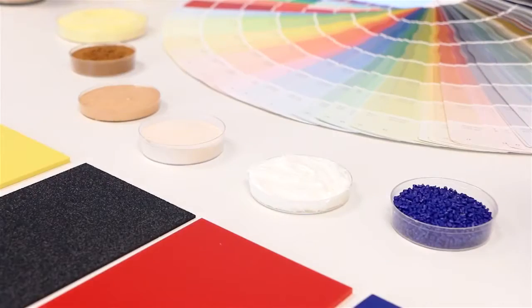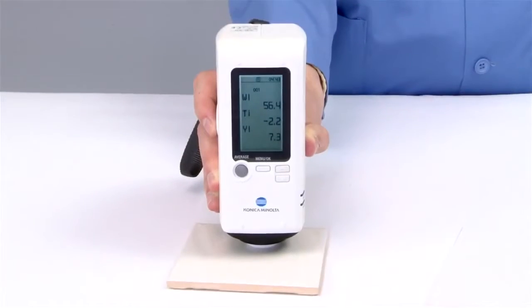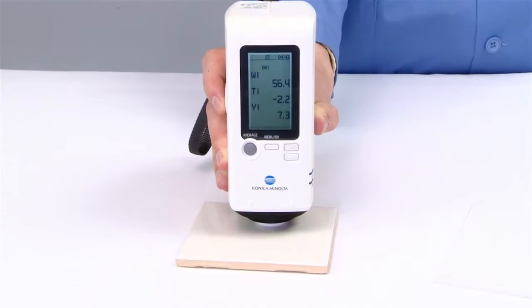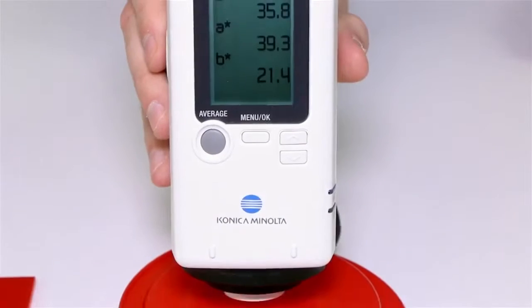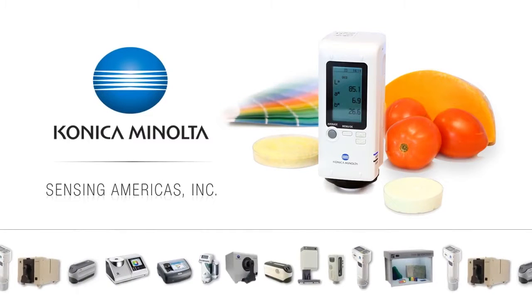Products and materials with inconsistent color negatively affect our perception of quality and freshness. To meet this challenge, Konica Minolta Sensing, the standard for measuring color and light, offers the new CR20 color reader.